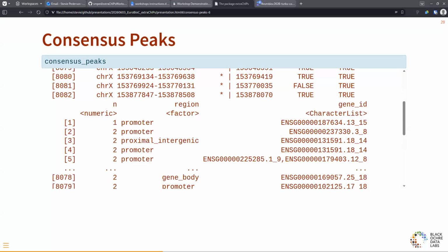For example, where the TSS is, when you define an interval downstream, you don't go over. Or if you say 500, it's always going to be 500 no matter what's there. Well, it's your preference. I don't think anyone agrees on how big a promoter is. If we went around this room, we'd all have a different answer. So you can set that however you want.